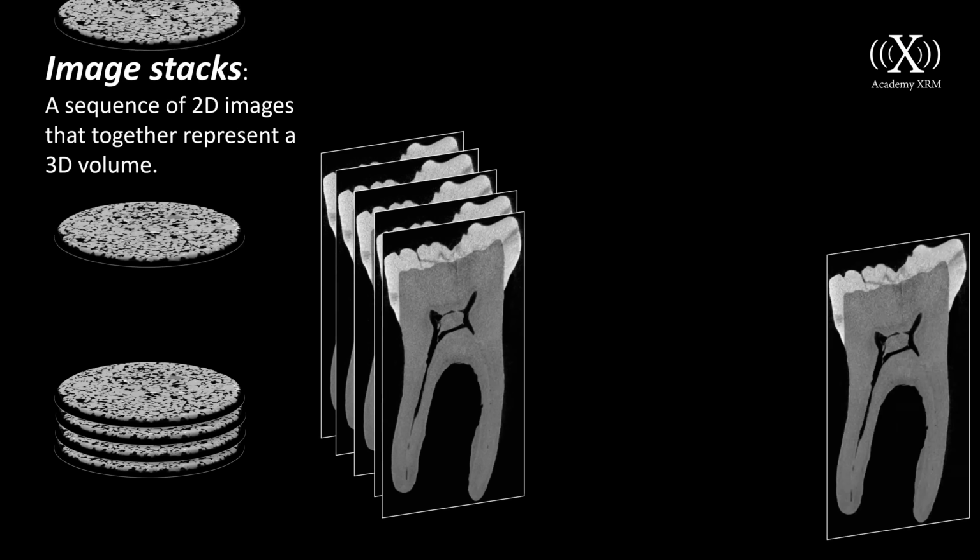Since 3D Slicer uses millimeters as the default unit, we convert our value accordingly. I enter 0.0159 millimeters, which is my scan resolution. And because micro CT scans are normally isotropic, meaning the spacing is the same in X, Y, and Z direction, I will copy this value into other dimensions. The volume disappears from the views, but no worries. Just click the center buttons and it will come back into view. You can also confirm here that the volume type is scalar, which we set earlier.